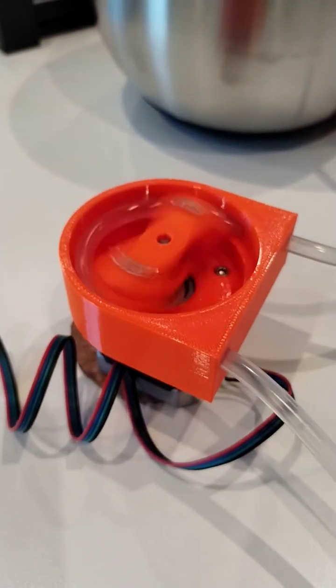So anyway, this is version 1. The first version I did with the rollers, the hose was coming off, so I did a concave part.